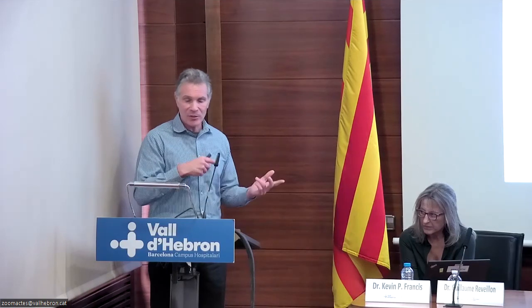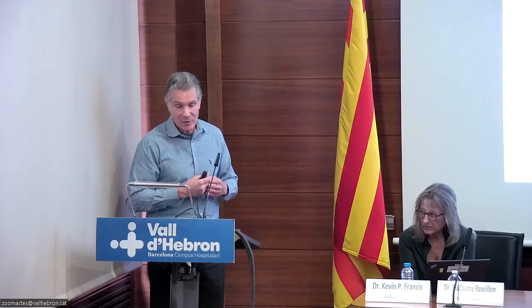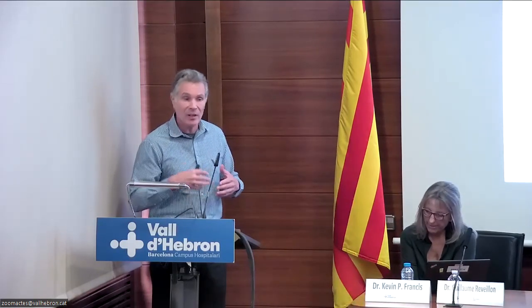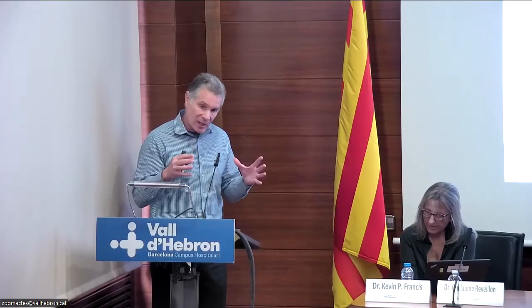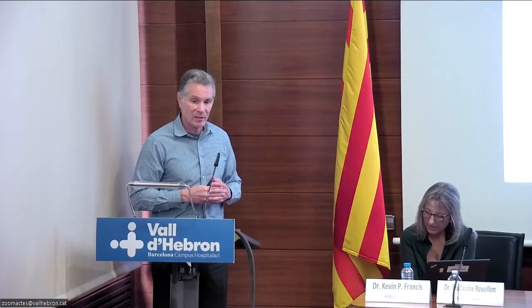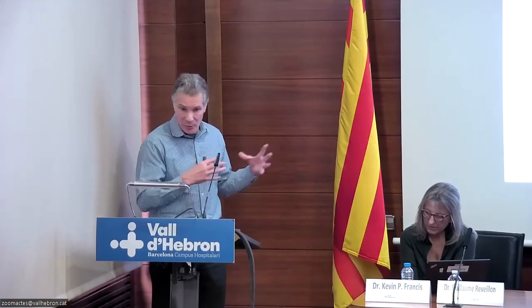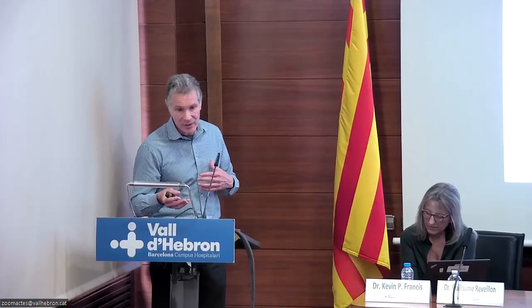The army, both in the UK and in the US, uses these types of cameras when they're imaging things like goats. When they're doing horrendous models on larger animals, they tend to use these external cameras. The disadvantage is you can't get absolute quantification from them. You can get an indication of what's happening, but not quantification, because they're not calibrated correctly. But with larger animals, you could put that animal into our system, and they have done that actually. In the paper, they put it into our system as well. A marmoset will fit in our system, and an African green monkey will fit as well.